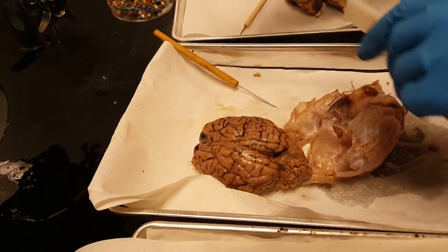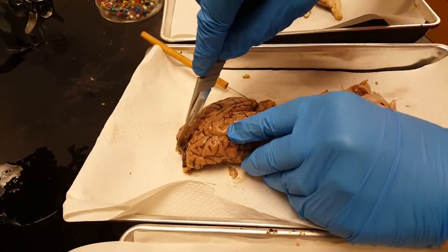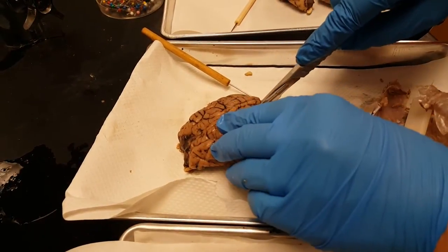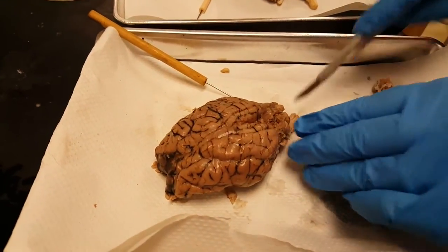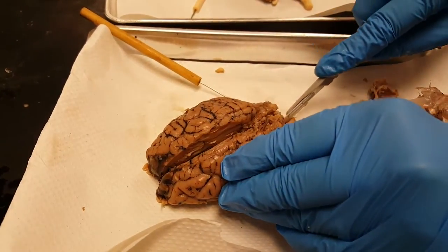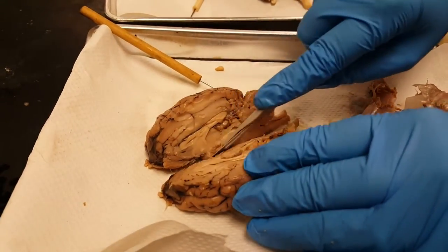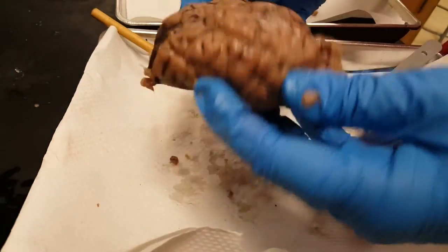The next step is to cut the brain down the longitudinal fissure, right there. It's pretty easy to cut with the scalpel. Just gently go through — keep the brain in the pan so you don't cut yourself. Kind of spread it apart and then slowly just work through so the brain falls open.